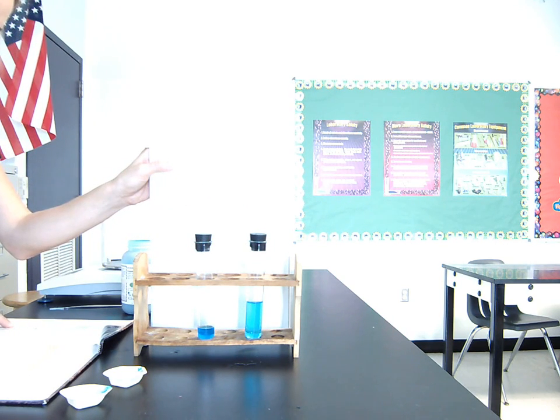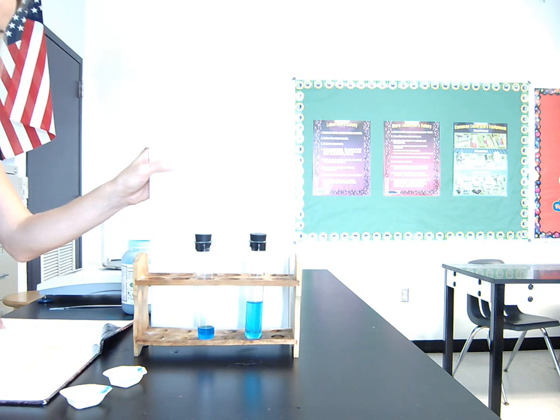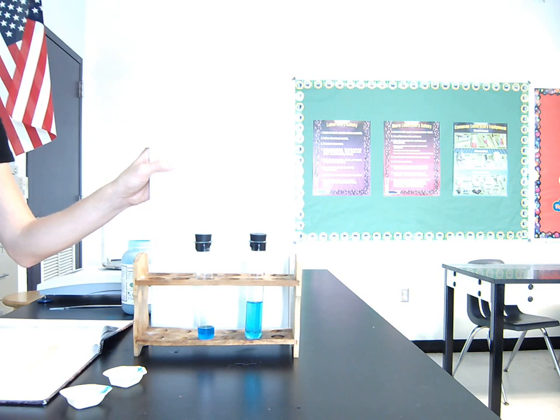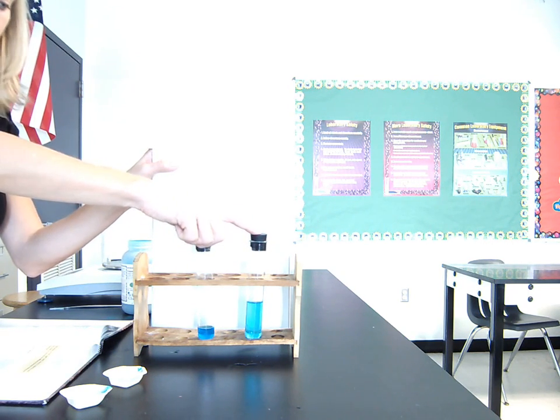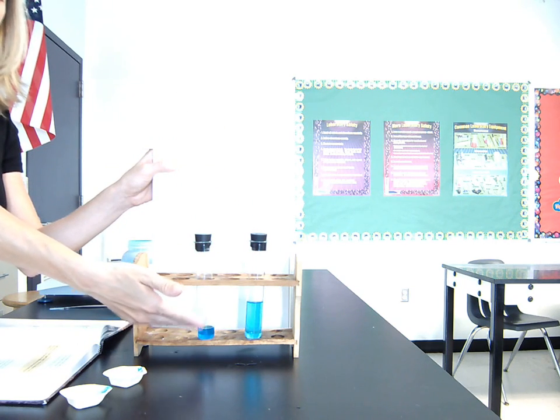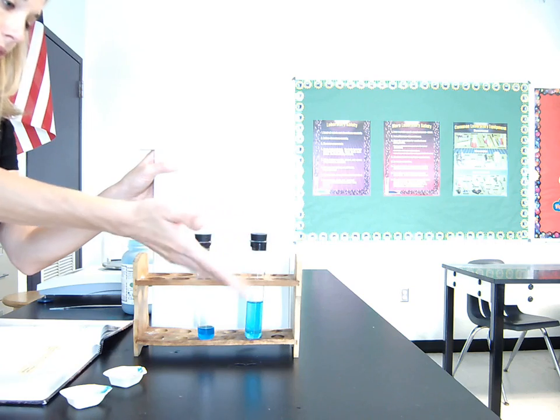However, this next blue dot asks you to compare them to each other. Is the shade of color the same in the first and second solutions? Well, no, obviously they're not the same. This one is much darker. Oops, that's the light one. This one's much darker than this one is, again, because this has less liquid for all that blue stuff to dissolve into. This one has more room to spread out, so it's going to be a little bit lighter.